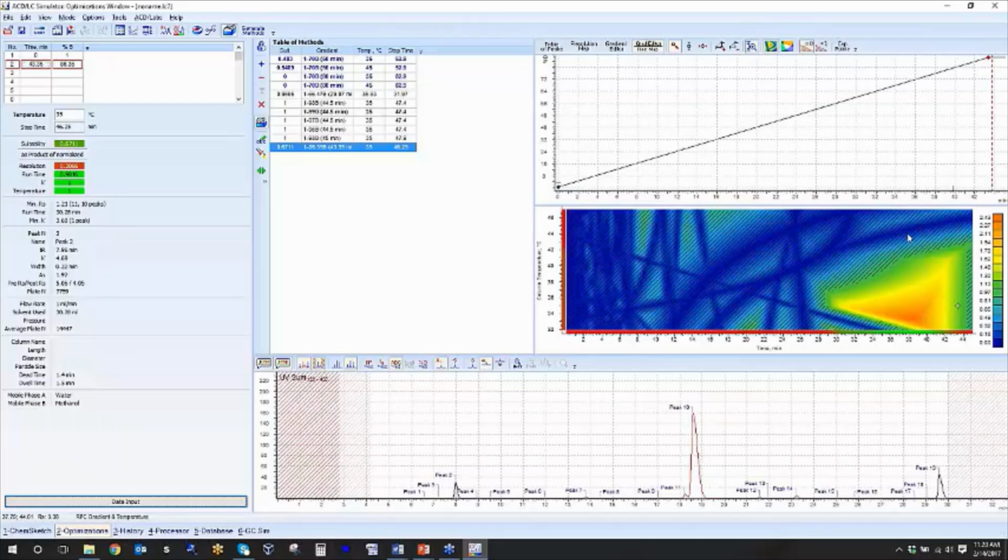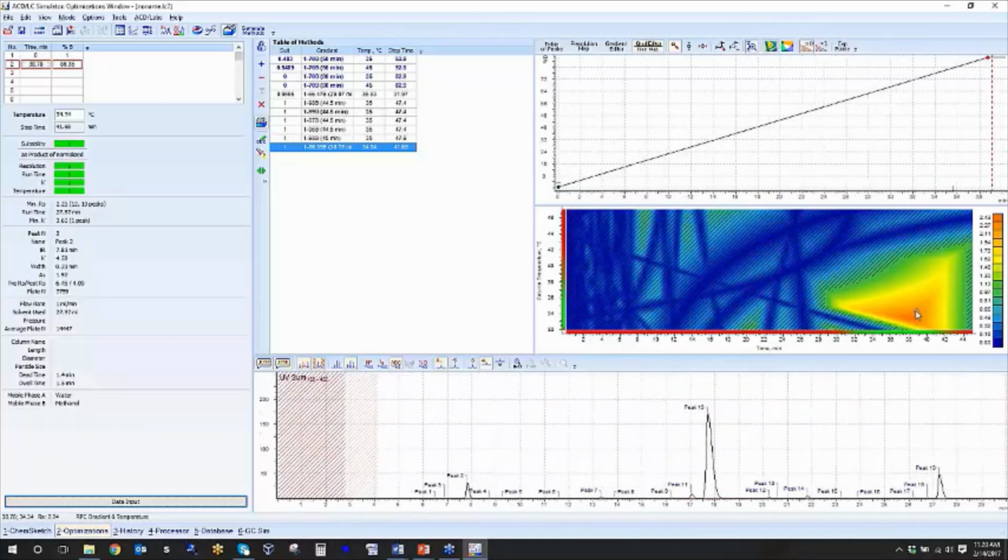And if we look at the blue regions, those are areas where that criteria was not met so well. So an ideal situation would be to be somewhere where you have a good region of the same color. So this would be, if you're standing in one spot, you want to be able to walk around a little and not have to worry about taking one step and falling off a cliff.